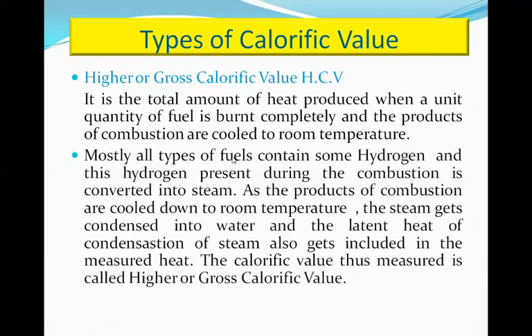Mostly all types of fuel contain hydrogen, and the hydrogen present during combustion is converted into steam. As the products of combustion are cooled down to room temperature, the steam gets condensed into water, and the latent heat of condensation of steam also gets included in the measured heat. The calorific value thus measured includes the latent heat of condensation and is thus higher, and is called higher or gross calorific value.